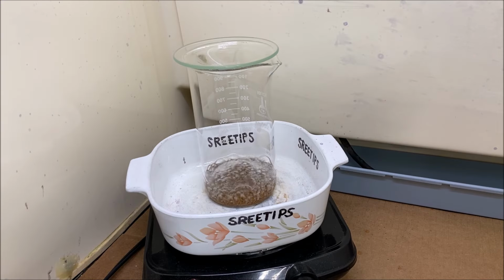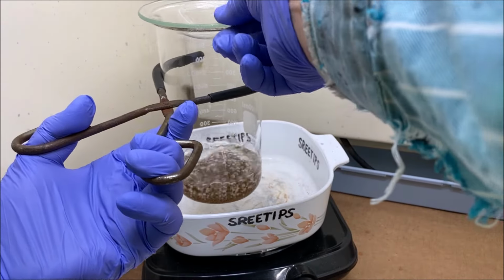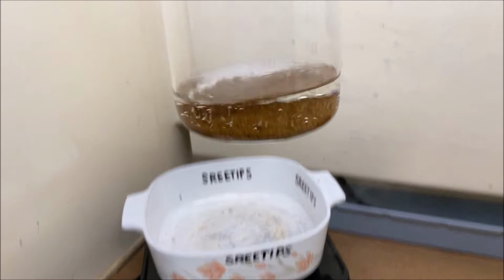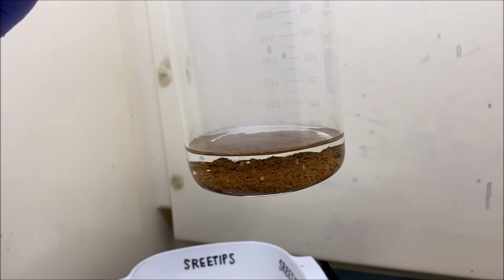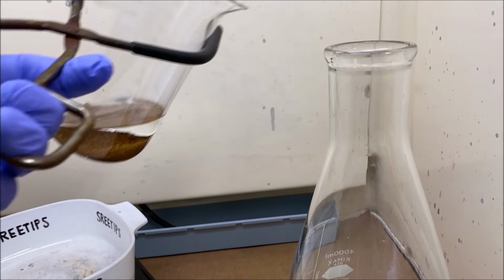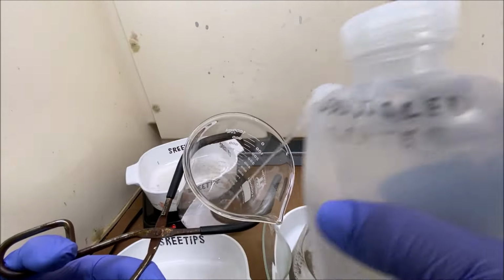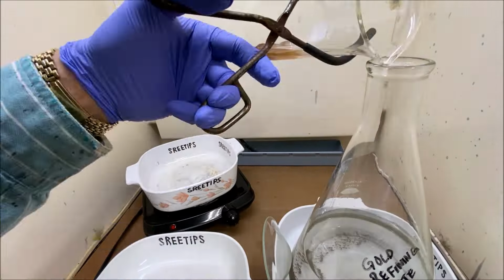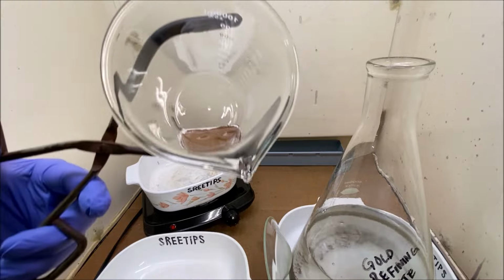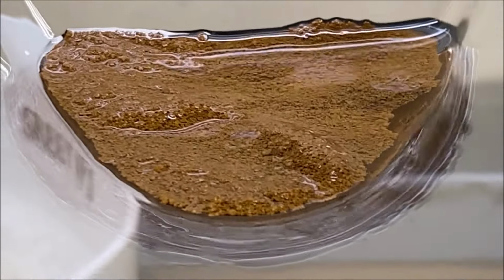It's been boiling in hydrochloric acid for about a half hour now. Not half hour, about 10 minutes. You can see the gold looks really, really good. And what we'll do is pour this off now into our waste container. Okay, our gold is nice and clean now.